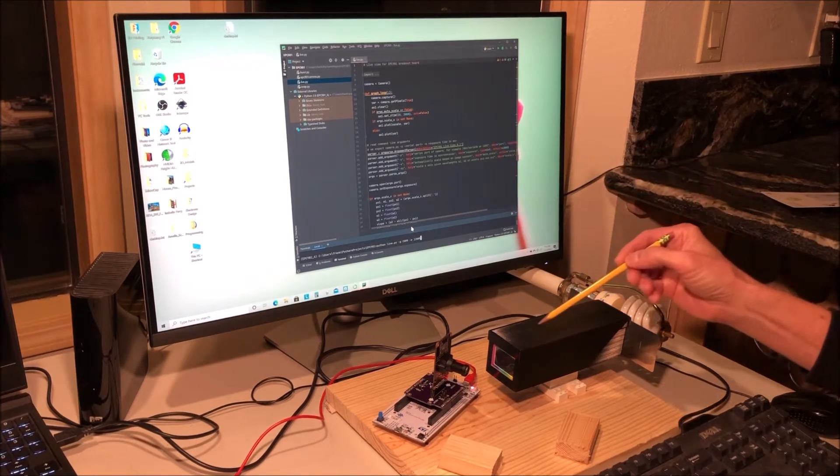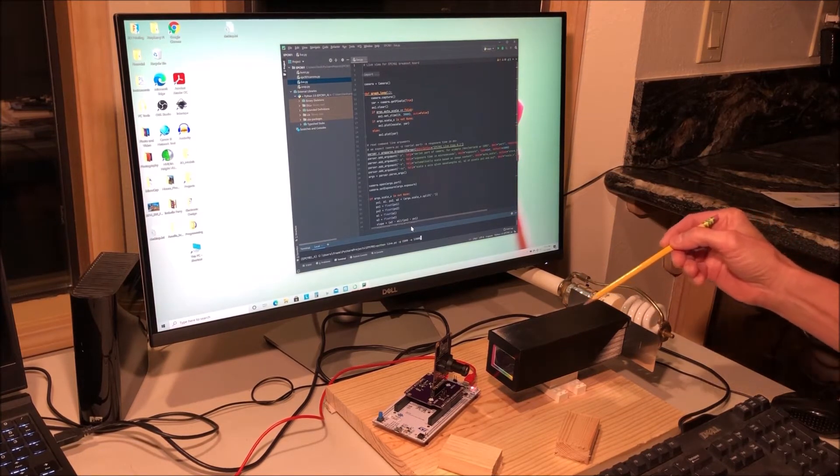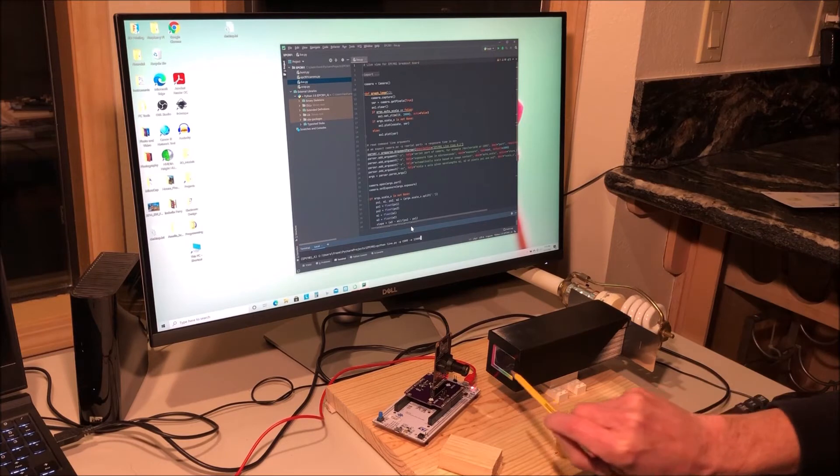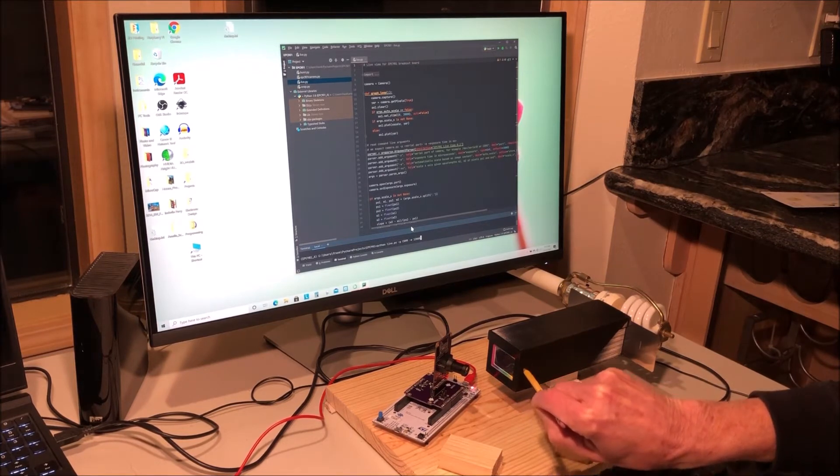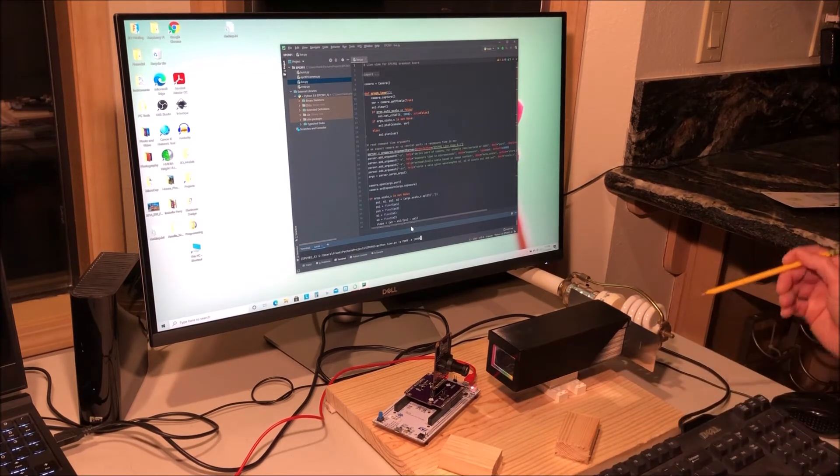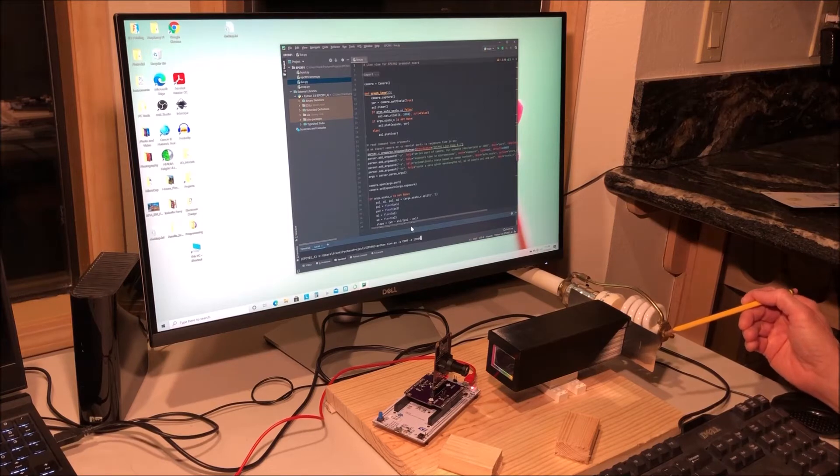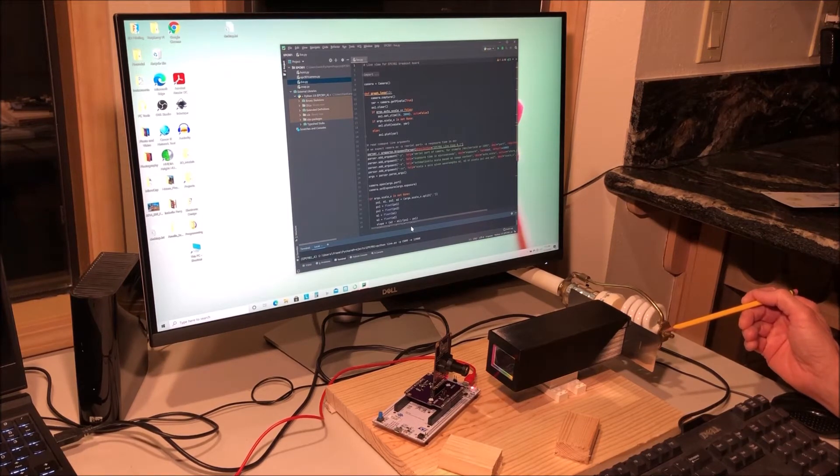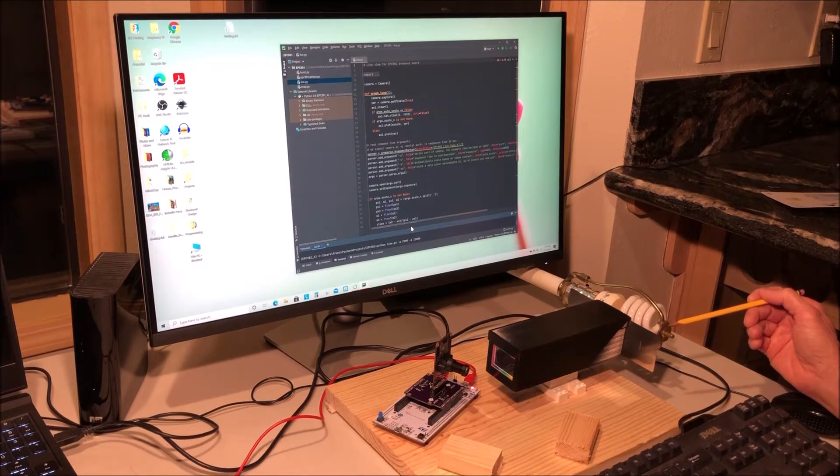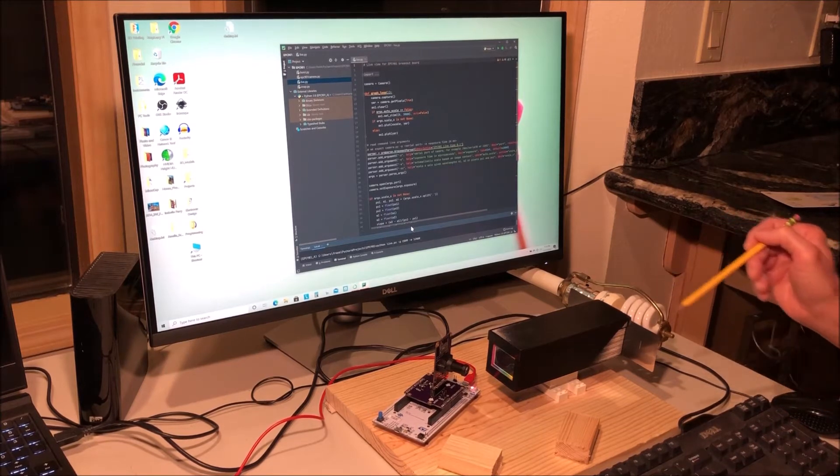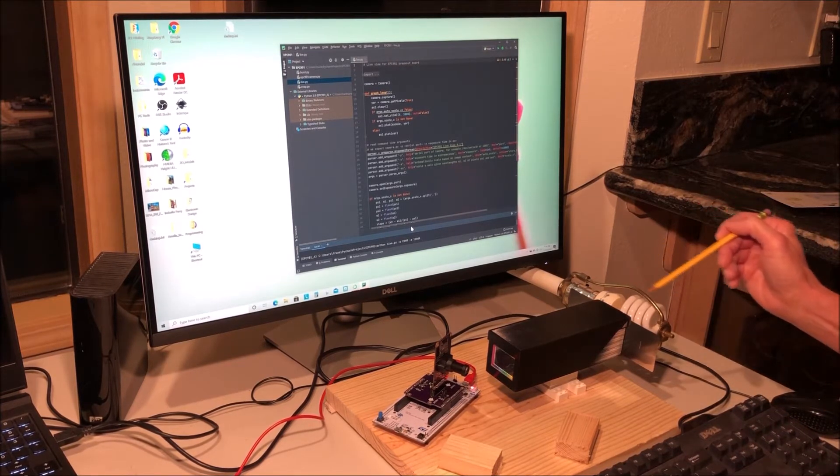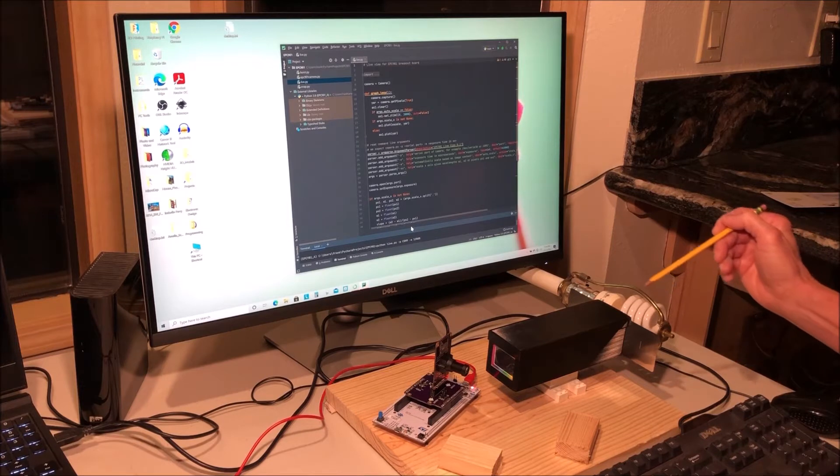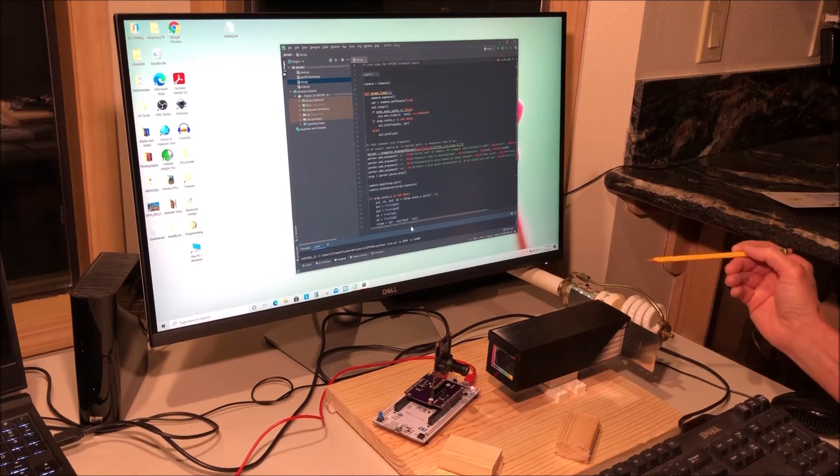The spectroscope itself is located here. There's a diffraction grating on this side and on the back here there is a stainless steel slide with varying size slits that can be moved in and out to change the slit size.